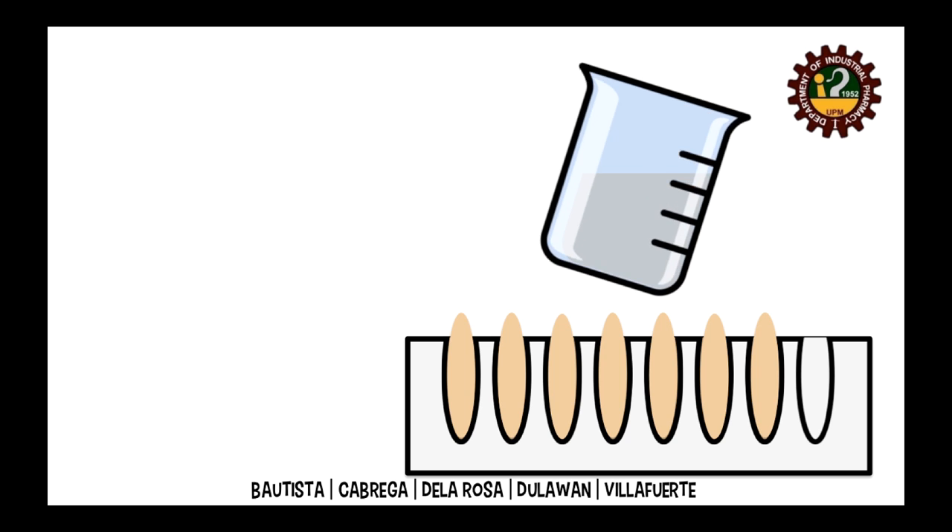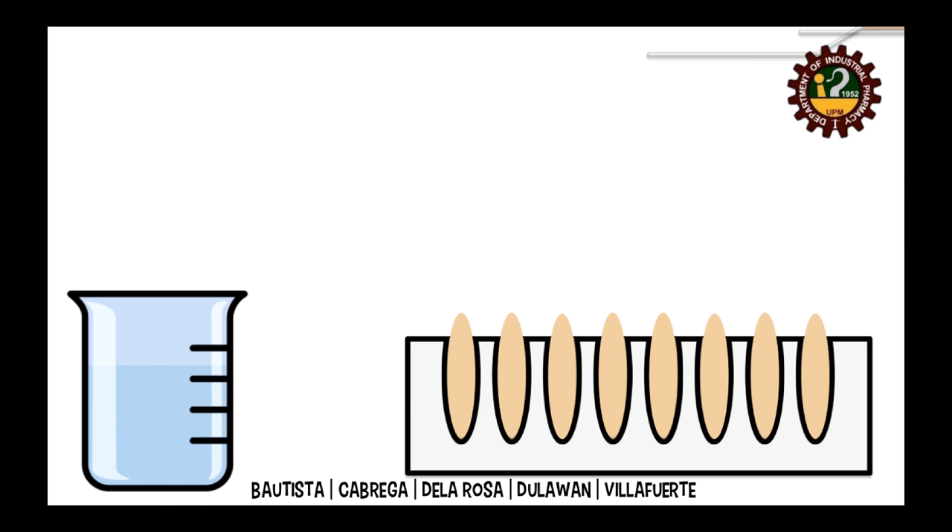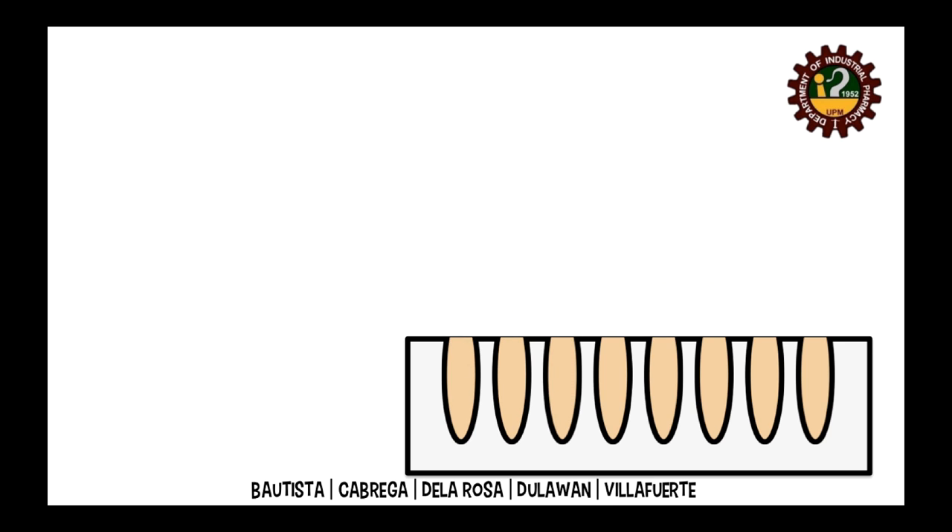After the melt has solidified, the excess material is scraped off using a spatula previously dipped in warm water. The suppositories are then removed from the mold.